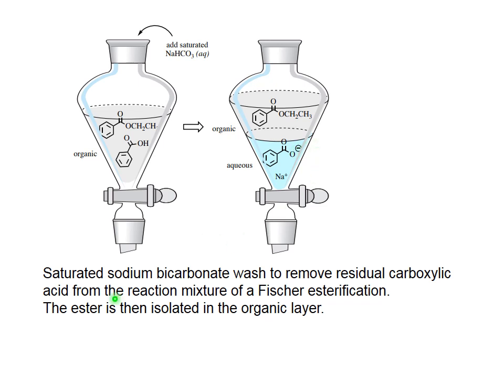So the ester is in the organic layer, and benzoic acid in the form of benzoate is in the aqueous layer. We remove the aqueous layer, and we have separated our neutral compound.